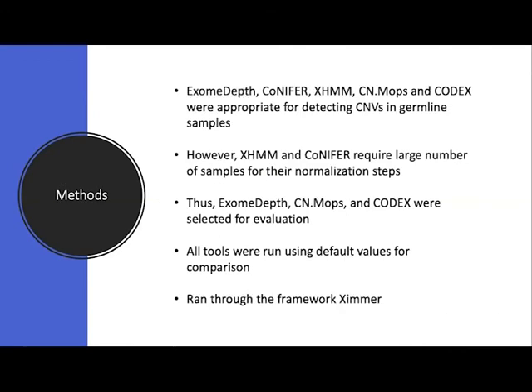In my literature review, I identified that most CNV detection tools were for somatic CNVs in tumor samples. The NCGENES2 pipeline, however, seeks to identify CNVs in germline samples, so non-tumor samples. Many of the reviewed tools required matched tumor-normal samples to compare copy number state, which did not apply to germline samples. There are far fewer tools available for the identification of germline CNVs using exome sequencing.